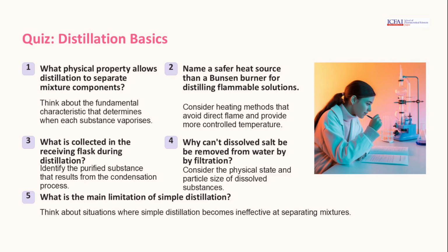Let's test your understanding of distillation basics. Consider what physical property allows distillation to separate mixtures, and think about safer heating methods for flammable solutions. Reflect on what is collected during distillation and the limitations of simple distillation.